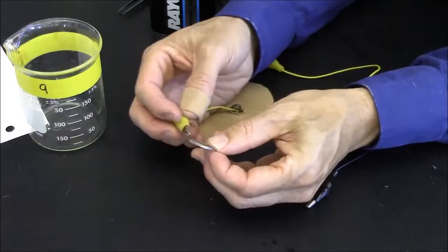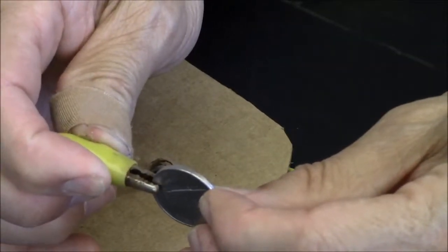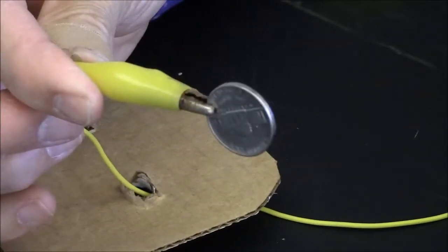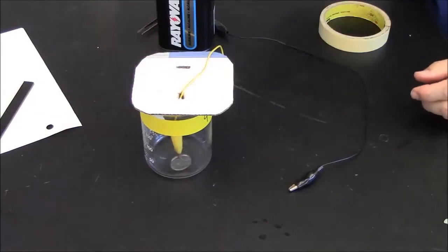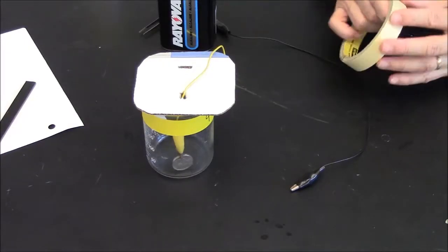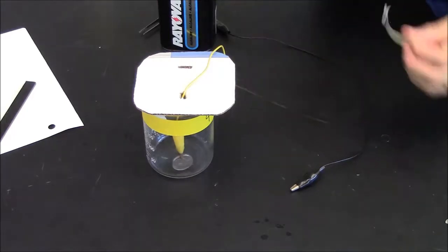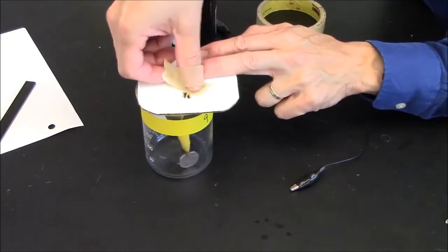I want to clip it so that I'm just clipping the edge of the coin. That's nice, just the edge of the coin. Here you can see the cardboard lid on top of the beaker. The coin is just barely touching the bottom of the beaker, and I'll use a piece of tape here on the wire so that it will remain at that depth.